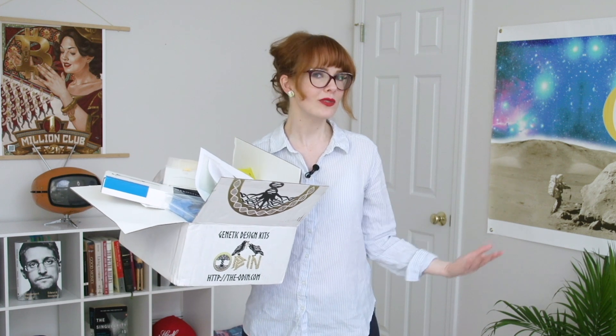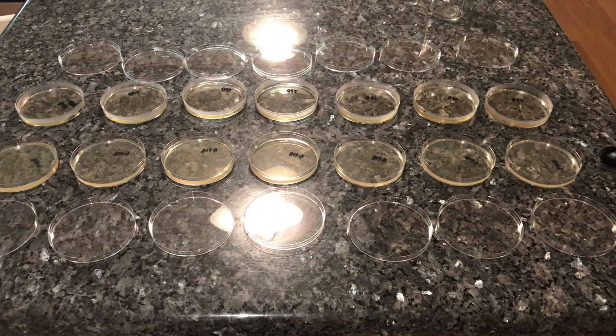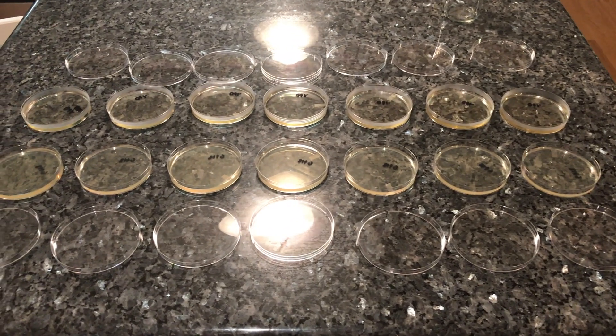Now onto the fun stuff — first we make our agar plates. This is the food that the yeast will grow on, and it's kind of like jello. We have two different types of agar here: one for growing our yeast, and the other for growing our genetically engineered yeast.